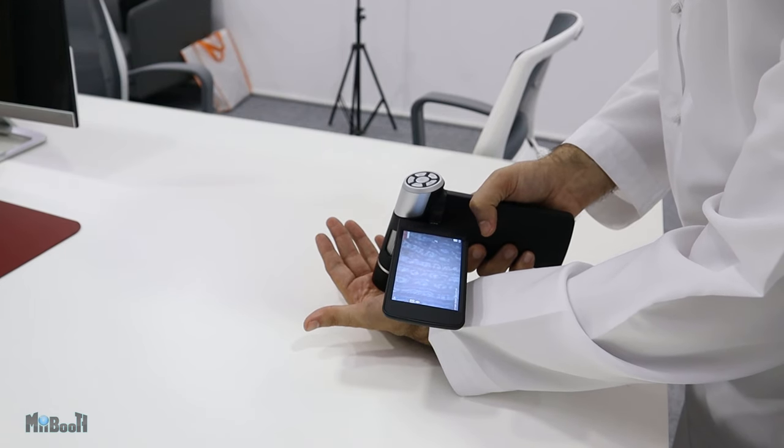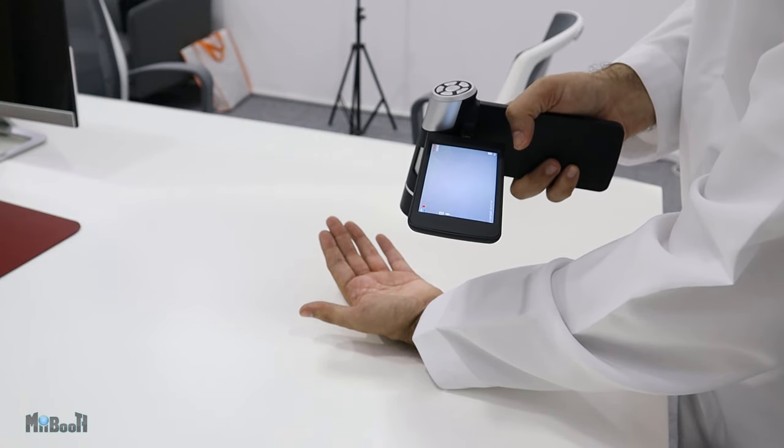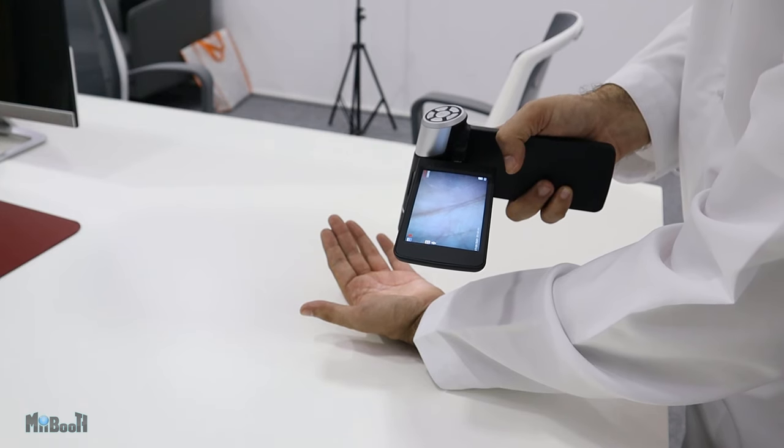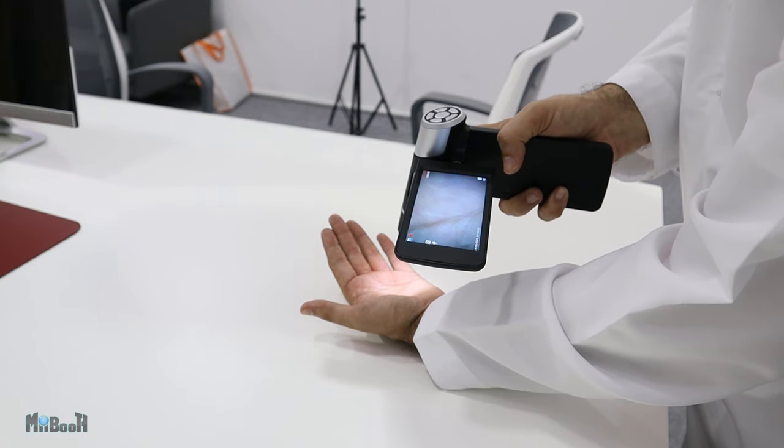The magnification is highest when you're right on top of the object, but sometimes that's too much. In this case it is so magnified I can see my sweat pores on my palm, but I just want to see my palm prints from a little farther away. The good thing is I can pull away and refocus and there it is. You don't commonly find this in handheld microscopes — when you move away, that's it, no more clear image. Not with this. You can move quite a distance from the subject and still focus for a decent image.